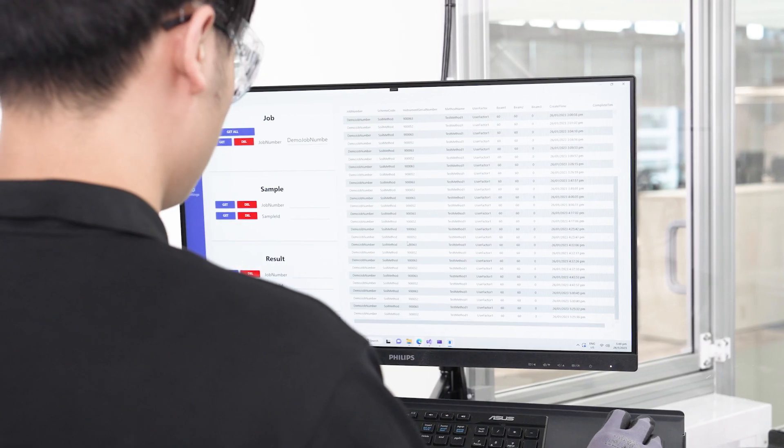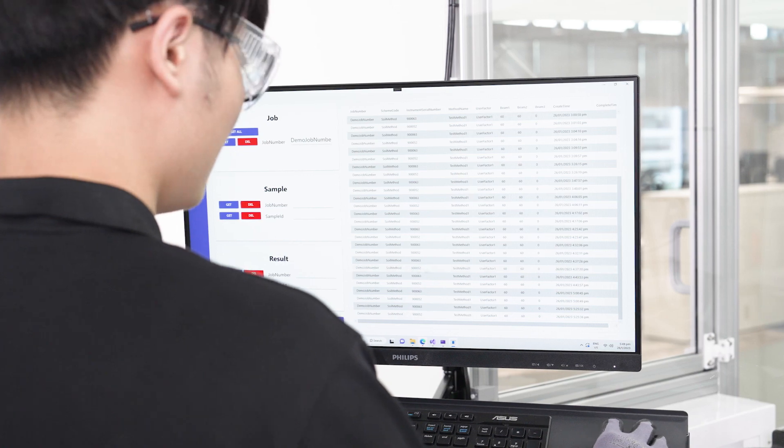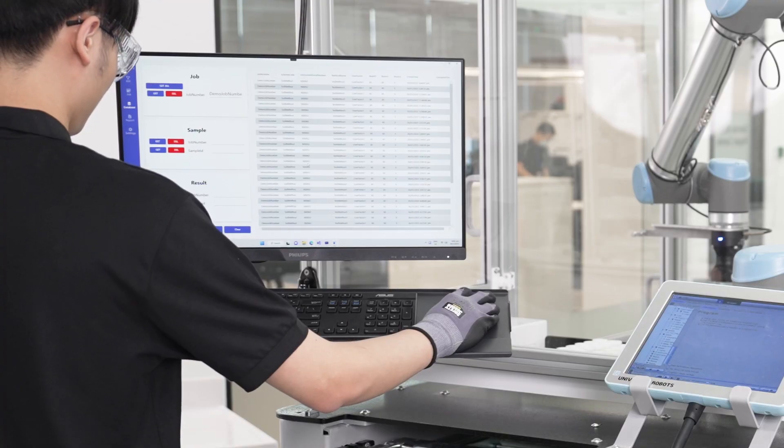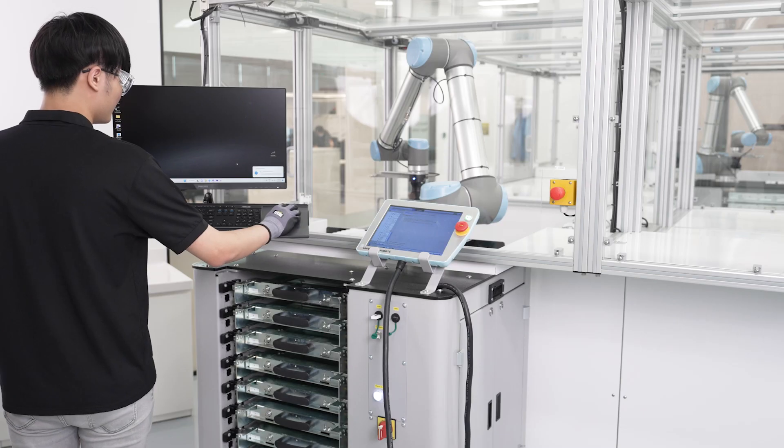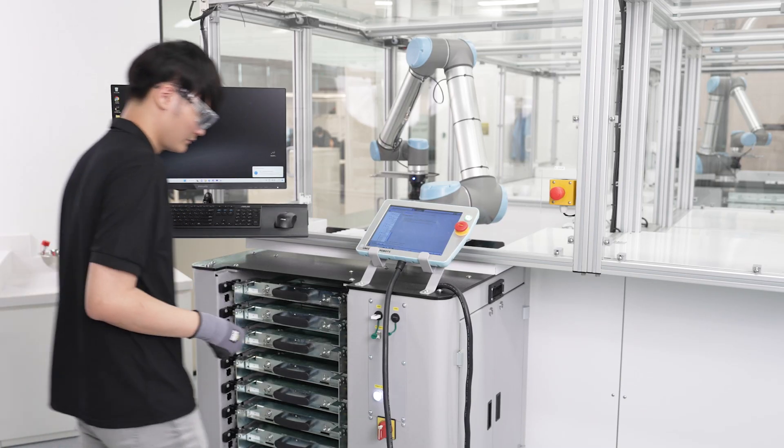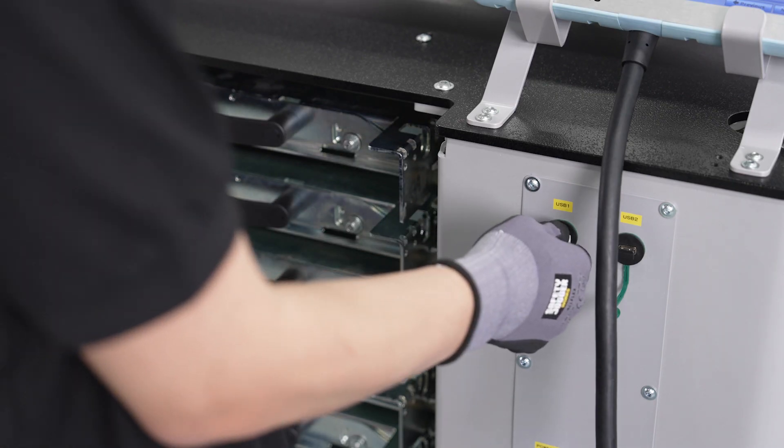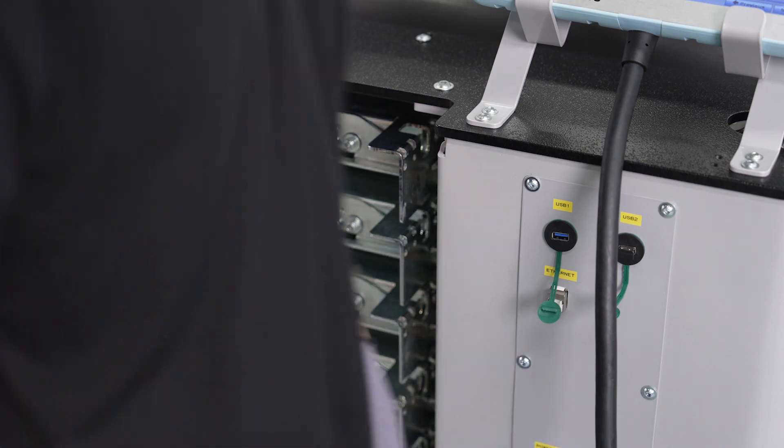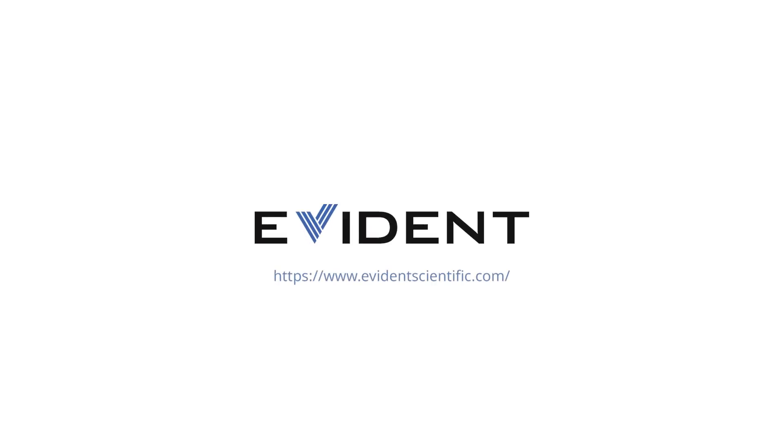Streamline your elemental mineral analysis with the Vanta IX automated sampling system. Contact us today to learn more.